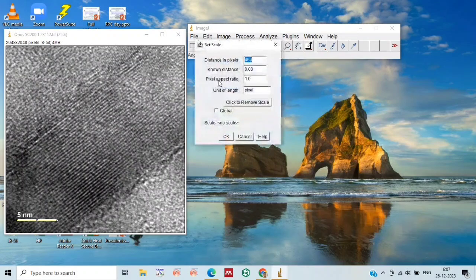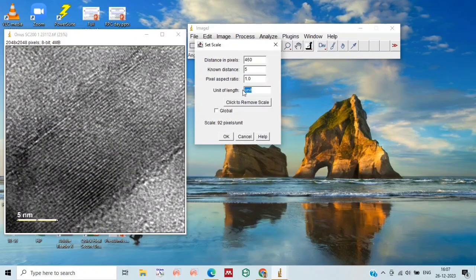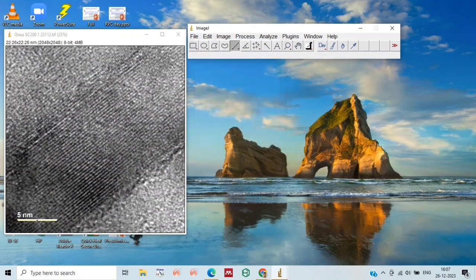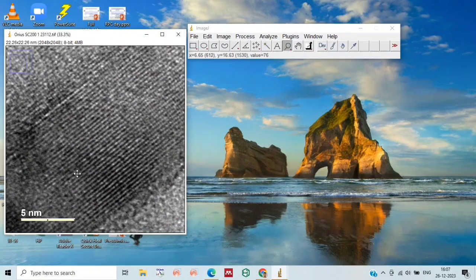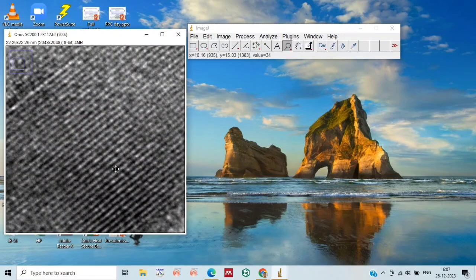Here we will fill in the known distance value, which is equal to 5 nanometers, and the unit is nanometer. Click OK. Now we will select the region and zoom in to where we want to do the d-spacing measurement.